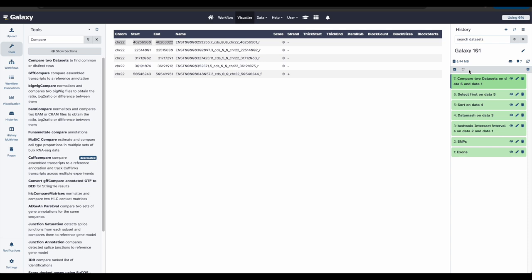But when you receive new data or new report is requested, it would be tedious to do each step over and over again. So wouldn't it be nice to just convert this history into a workflow that we will be able to execute again and again? Galaxy makes this very easy with the extract workflow option. This means that any time you want to build a workflow, you can just perform the steps manually once and then convert it to a workflow so that next time it will be a lot less work to do the same analysis.